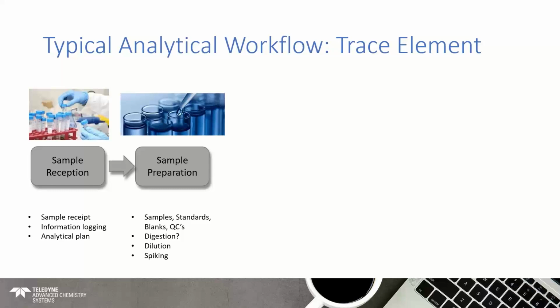So what do you do with these samples? So as part of the plan, there will be a process of preparing these, putting them in the correct form or state for them to be introduced into your instrument so you can generate your data. So there will be a means of preparing the samples themselves, but in addition to that, you never just analyze the samples on their own in a trace element lab. There will always be calibration standards that need preparing, blank solutions, there will be QCs that need preparing, all in conjunction with your samples.